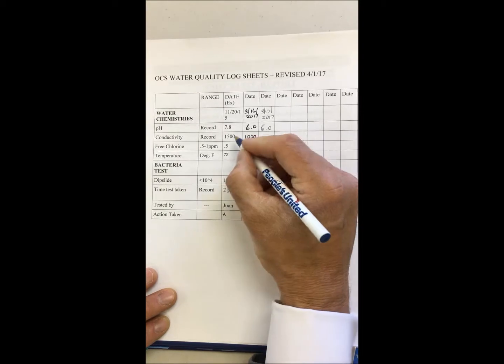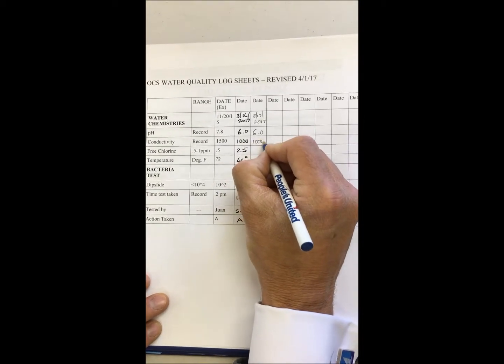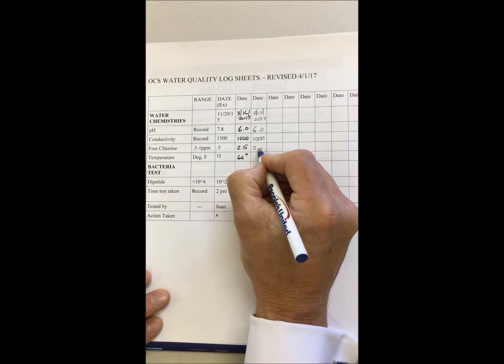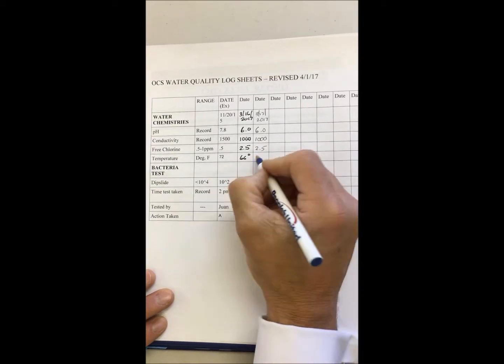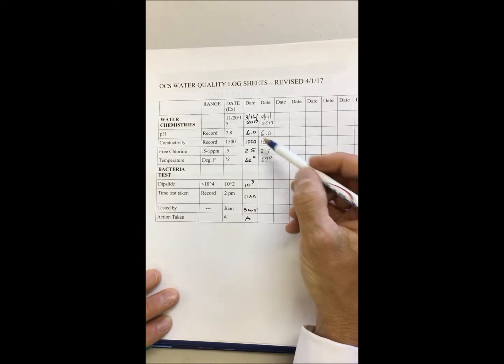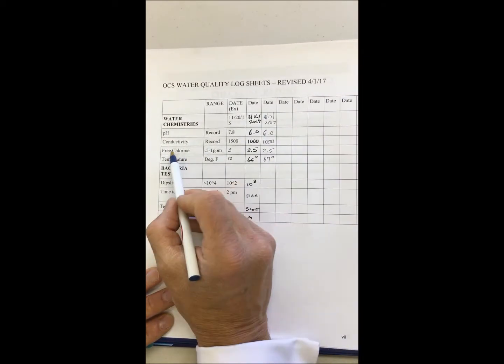Conductivity I received today was 1,000. I would note that in there as well. The free chlorine today was like yesterday at 2.5. And the temperature I got today was 67 degrees Fahrenheit. There's no corrective action to take here except on free chlorine.